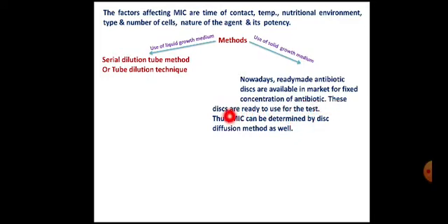So these discs are ready to use for the test, and that saves time. Therefore, MIC can be determined by the disc diffusion method also.